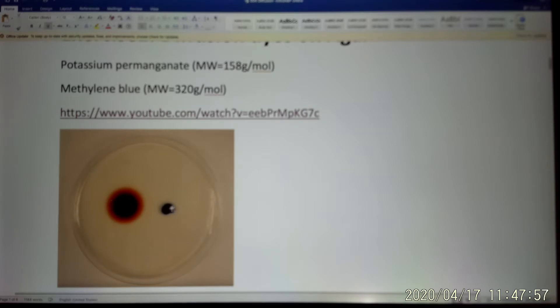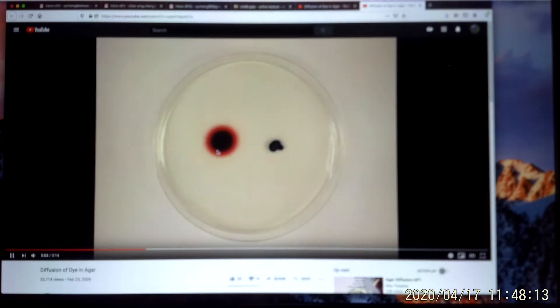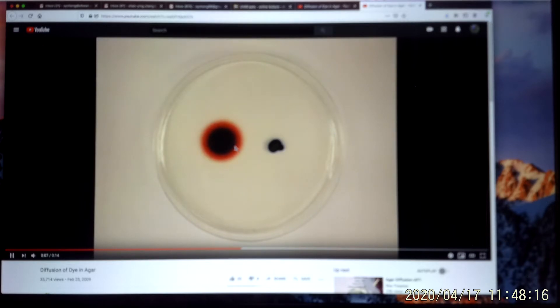When we put them on the agar, they are going to diffuse out. We wait to see which one is going to diffuse faster. And the experiment is going to look like this. So we found that potassium permanganate, through time, diffuses out much faster than the methylene blue.